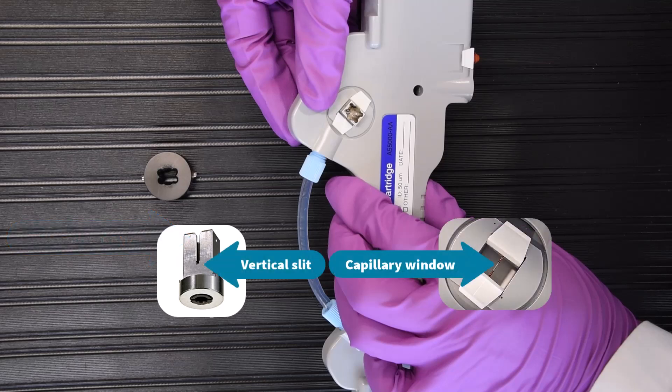Ensure that the vertical slit in the aperture lines up with the length of the capillary window, which should be visible through the cartridge window.